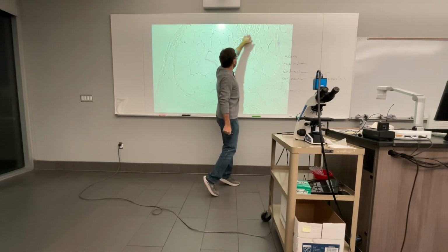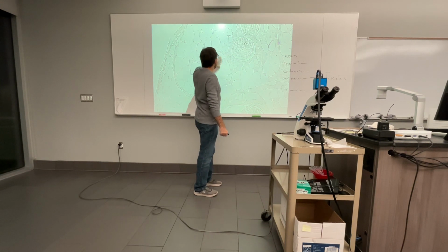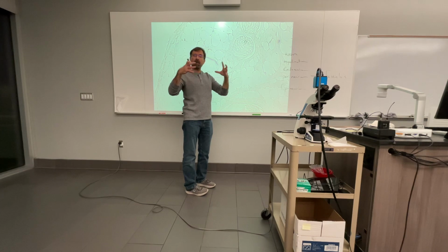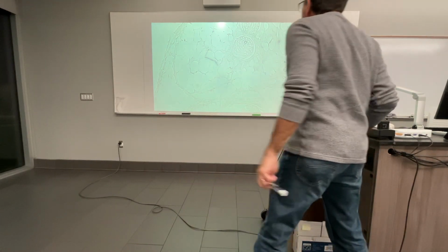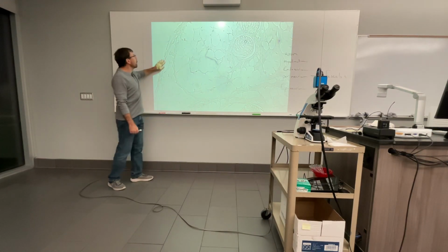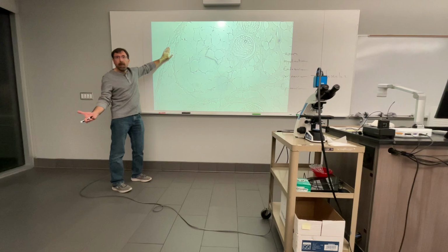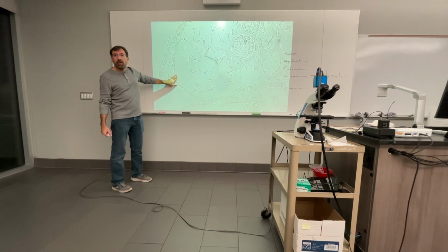So this is going to be my perineurium, and then beyond that is this adipose tissue, okay? That's supporting it, and it's kind of being used as a way to separate and isolate more. And so if I extend beyond that, and I'm going to go this way because this is the easiest. So I go this way, I see this outer edge here. That's my epineurium. I mean, it's easy to understand that that's the epineurium. You call this epineurium, that'd be okay too.